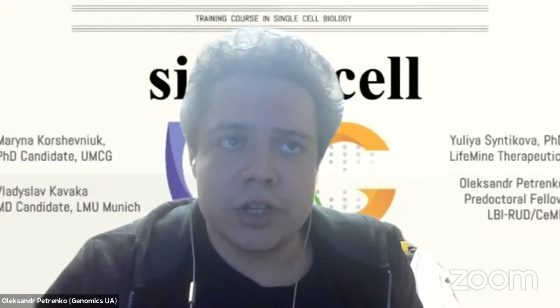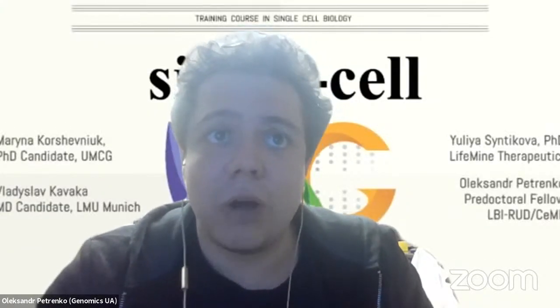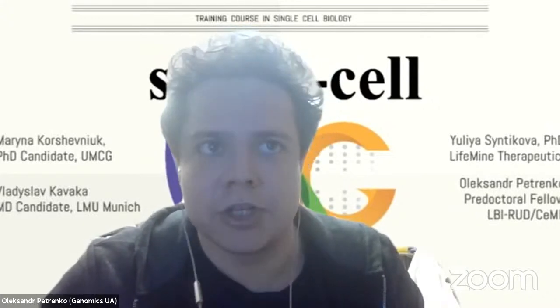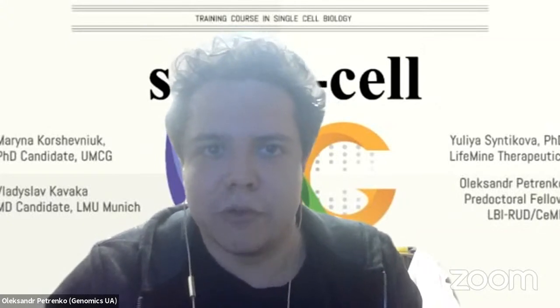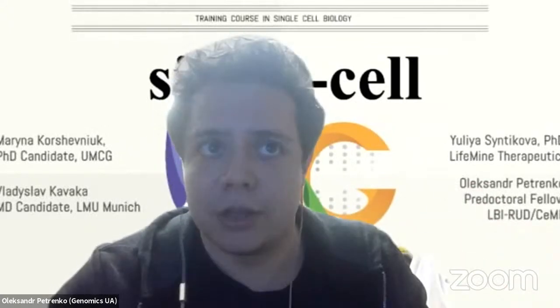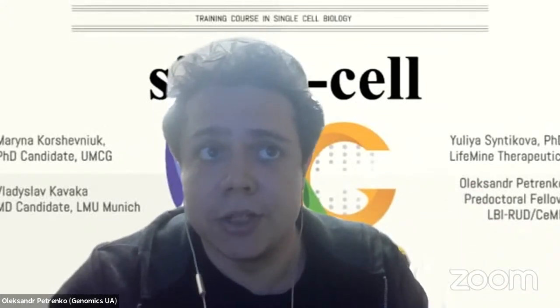Right. So question number 7: how can we know how many cells we have in each cluster? I think in the draft for tomorrow's workshop, I actually introduced this command. You can make a data table where column number 1 will be your clusters and column number 2 will be the count of cells per cluster. It's something you can make relatively easily computationally.